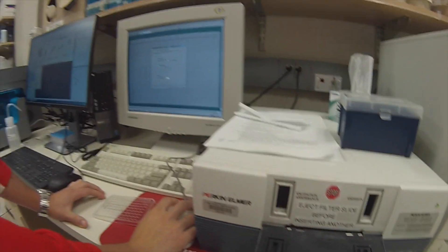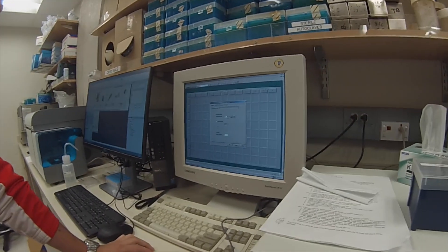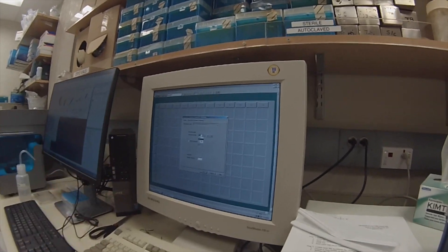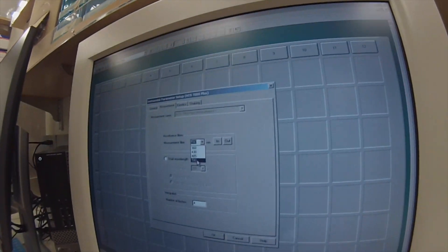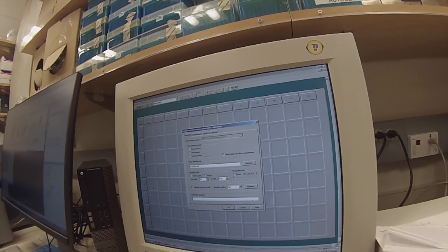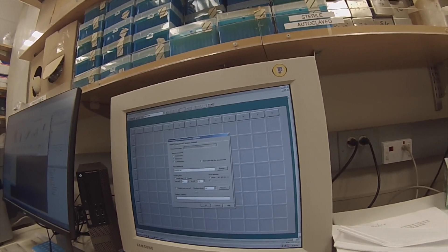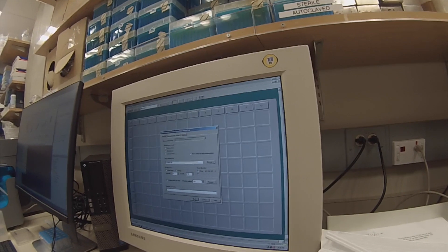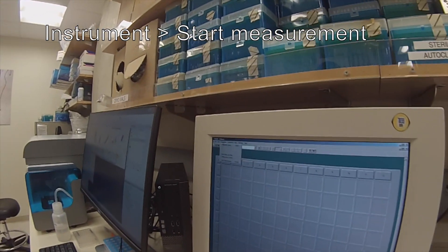Then we're going to be able to choose our filter here at the software. We'll just put 590. We will double check that we have the settings that we want, and then finally we're going to go back to Instrument, then Start Measurement.